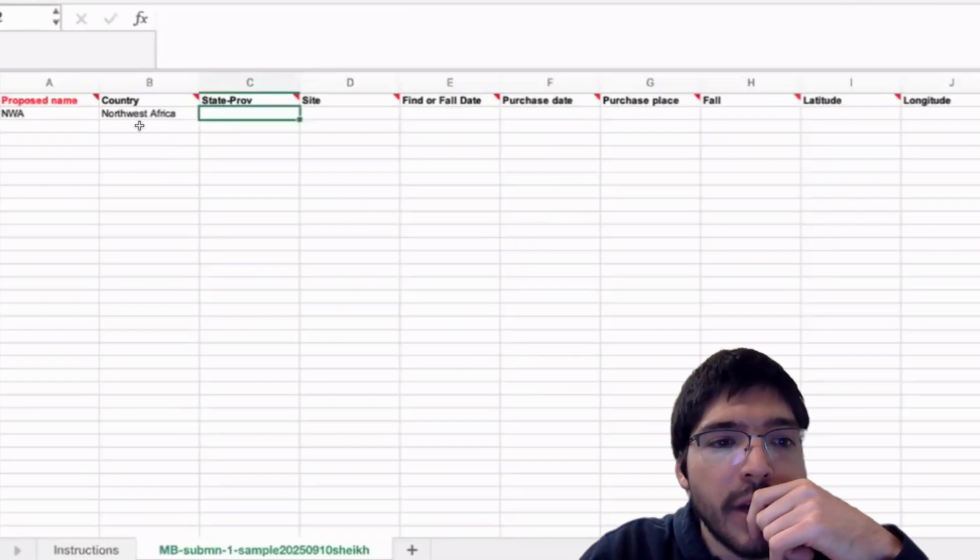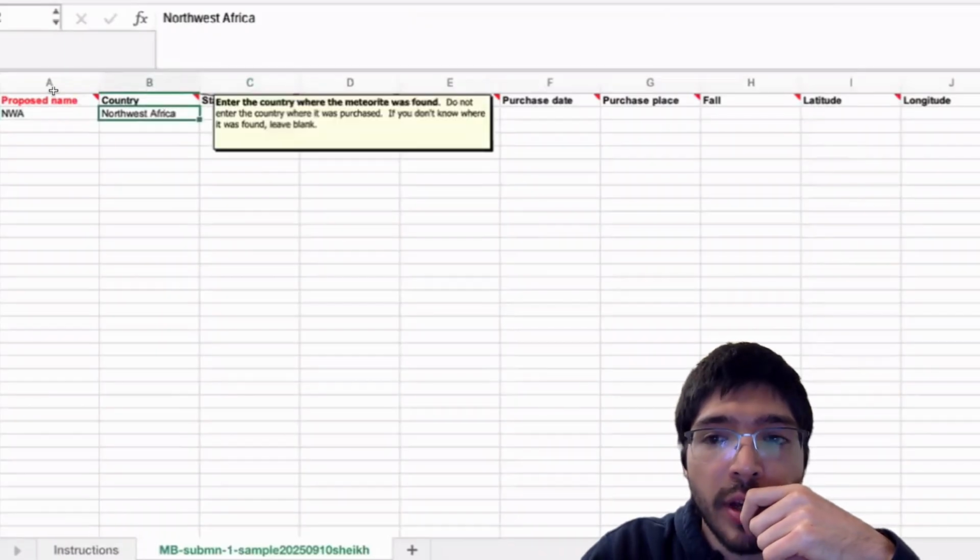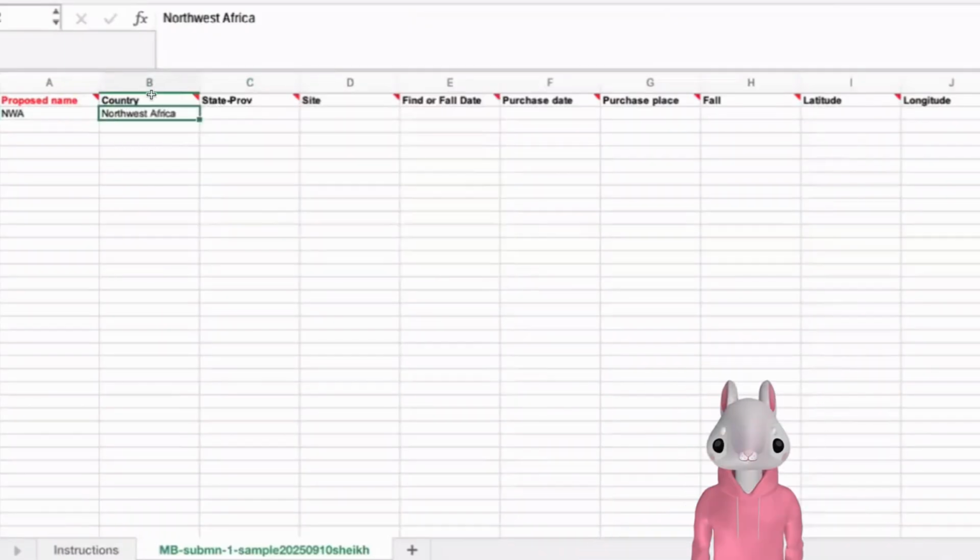So we're going to give it an NWA name. Country just means where it was found or reported to be found. Is there a specific country like Algeria or Morocco, or is it just Northwest Africa? Okay, all right, so we'll go with that.